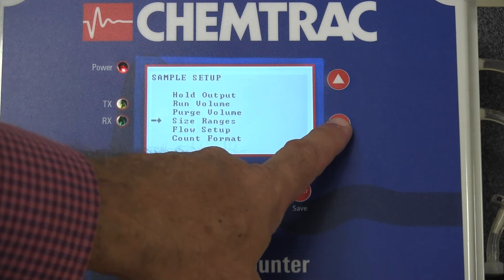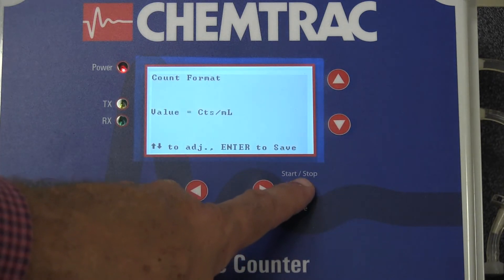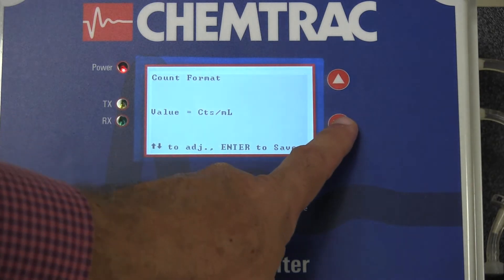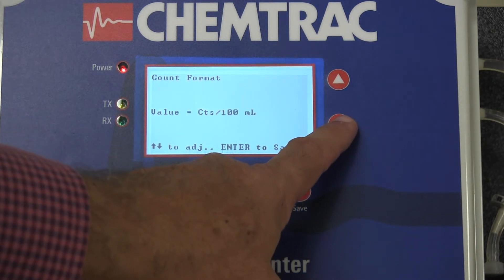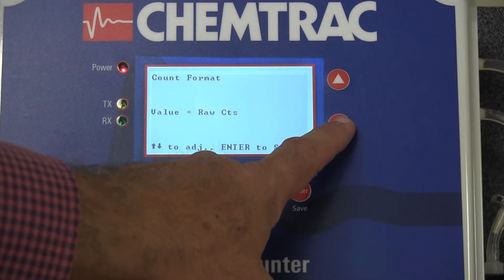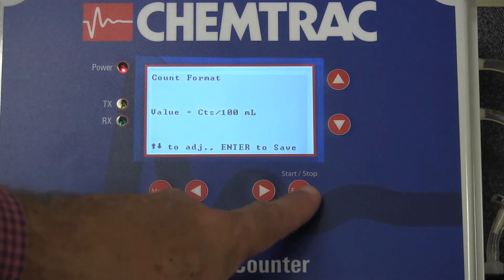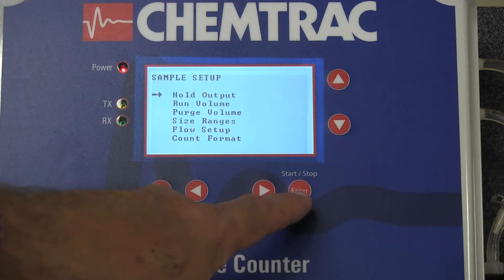The PC5000 offers four different count formats: counts per milliliter, counts per 100 milliliters, raw counts, and volumetric PPB. During calibration, counts per milliliter is used. While most municipal plants will use counts per milliliter, many industrial applications will use counts per 100 milliliters.